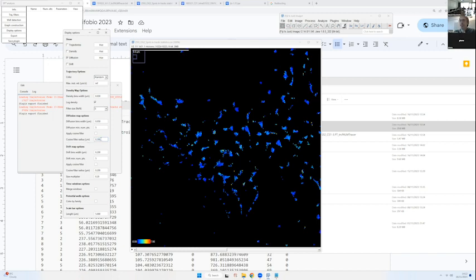So now I can have very, very small bins. What matters is the radius of my cosine filter. To not have a big artifact, we apply a cosine weight function as a function of the distance to the bin. So if your displacement appears very far from the center of the bin, it will not contribute a lot to the final value.